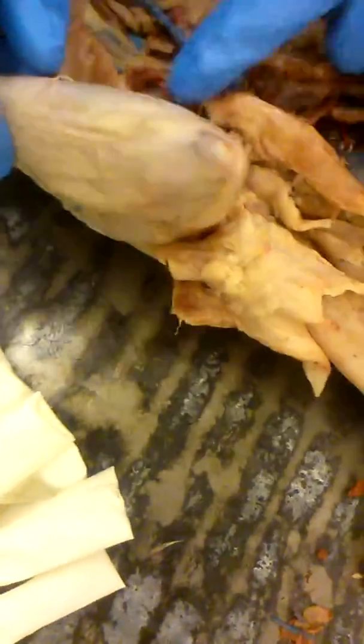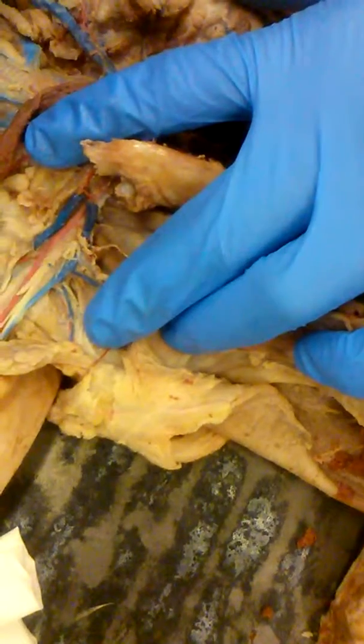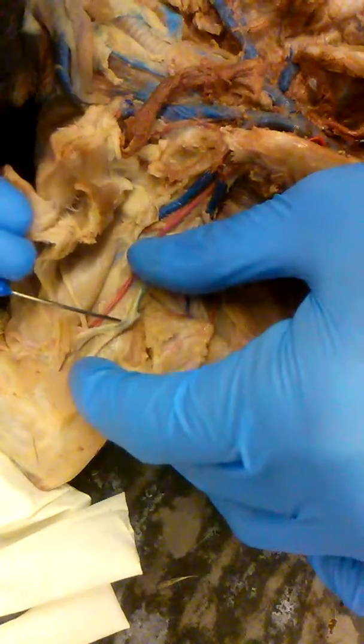So, like right here, it's going to be the axillary. On the shoulder. Axillary artery? Or just axillary? Axillary artery. And then when it's more in the arm area, it's your brachial. That's as far as you have to know on the cat.